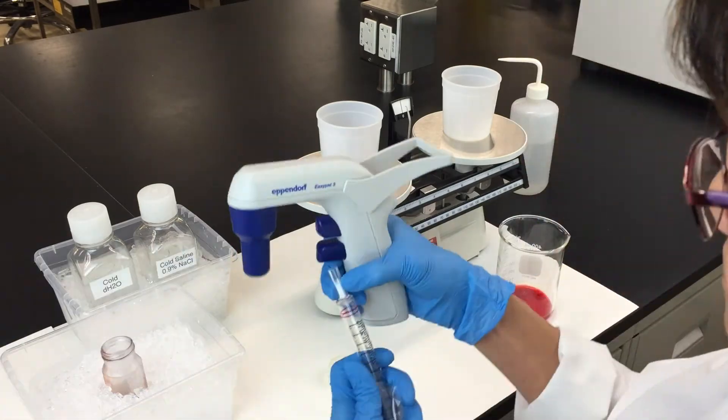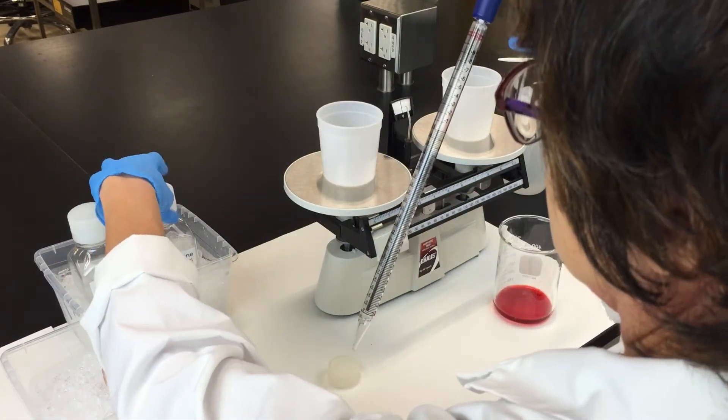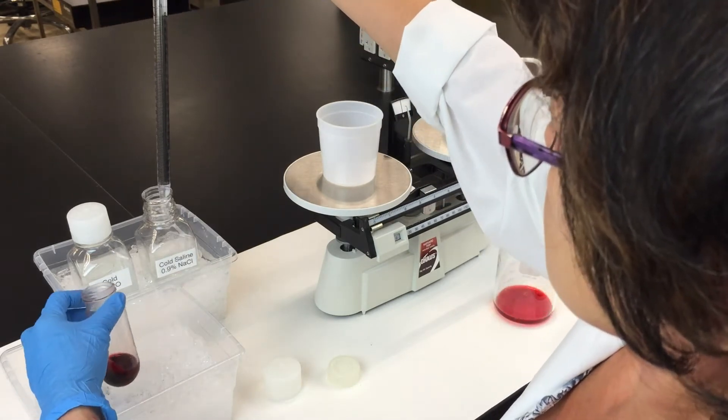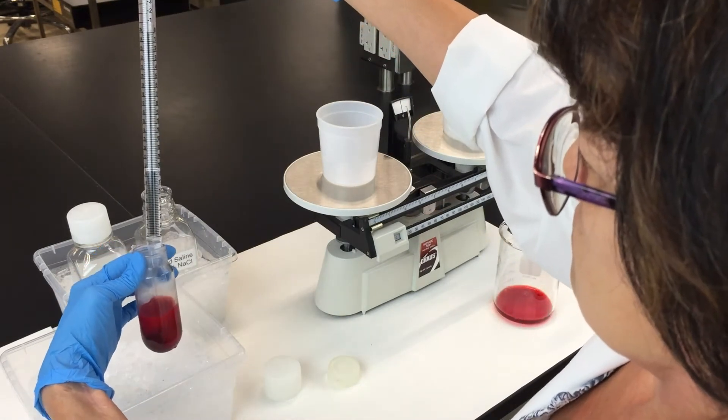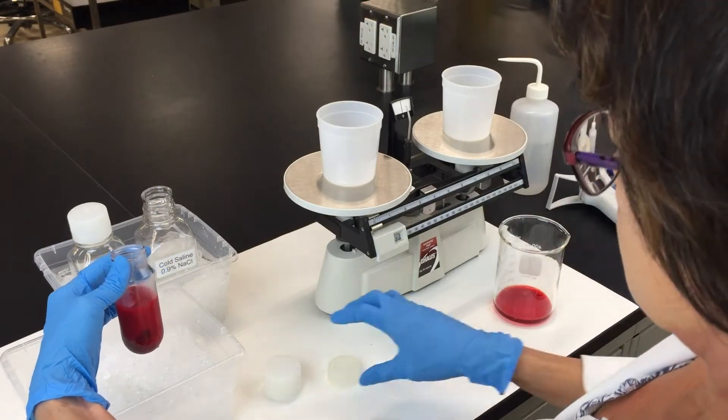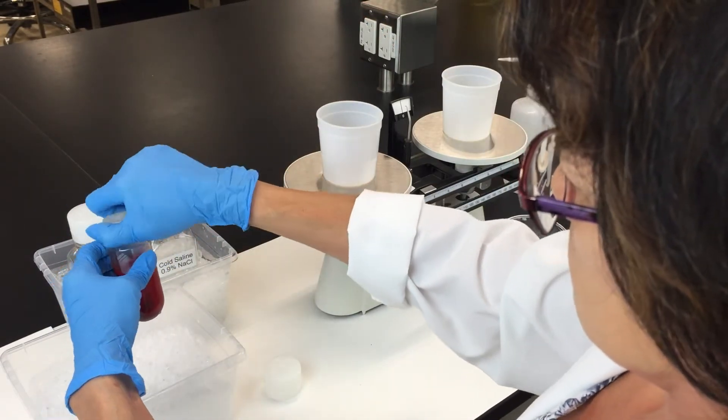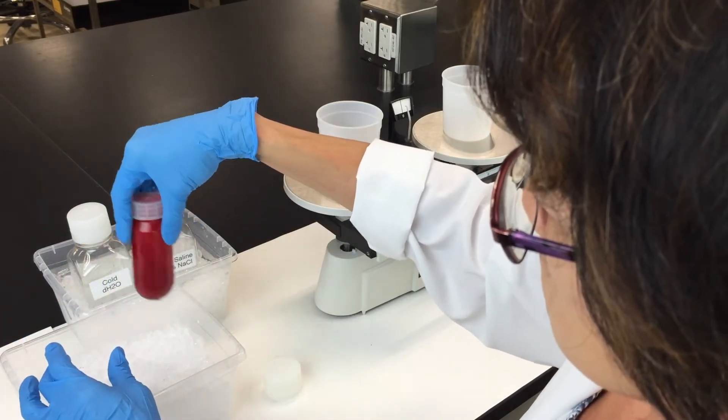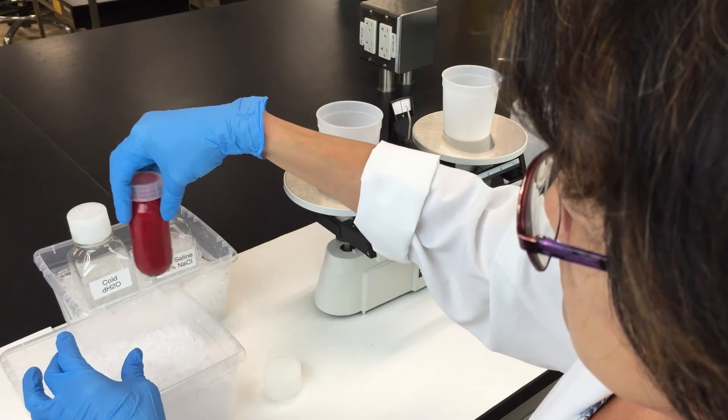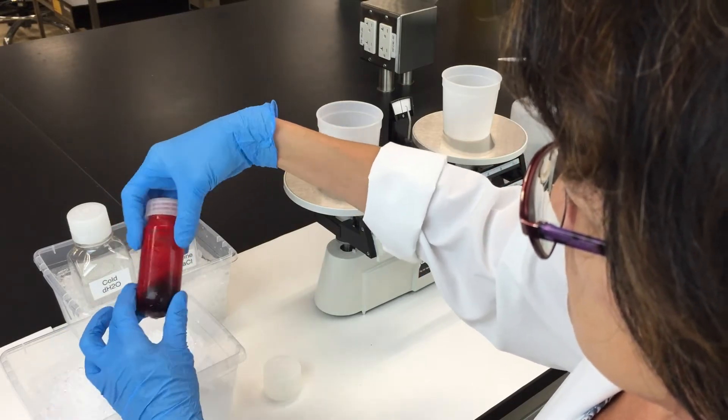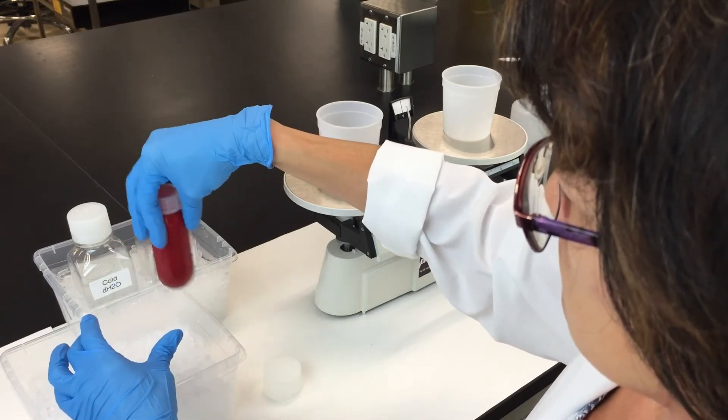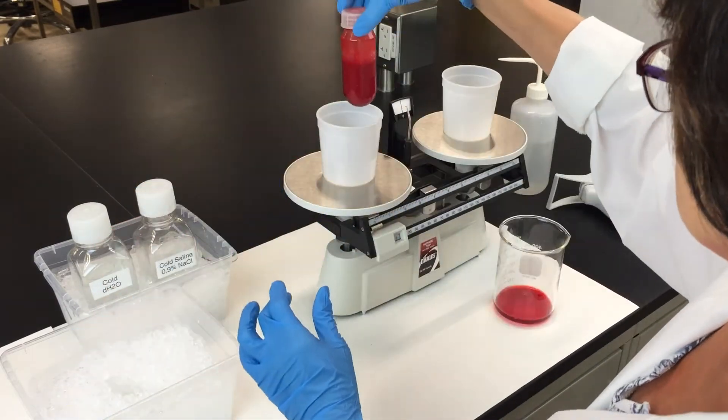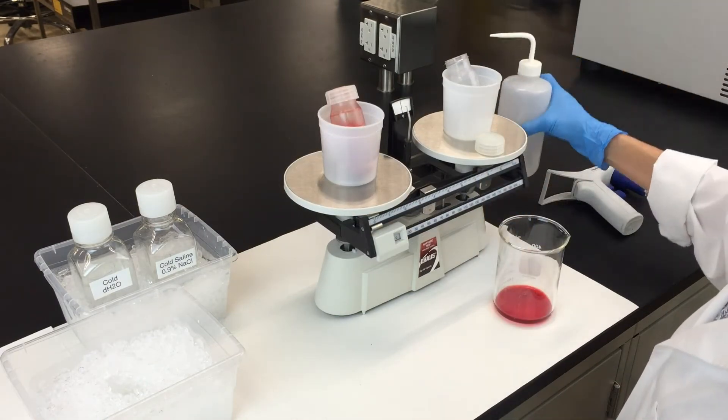Next, add 30 ml of cold saline to wash the red blood cells. Now swirl the tube gently to re-suspend the red blood cells. Balance the tubes and do a second spin in the centrifuge.